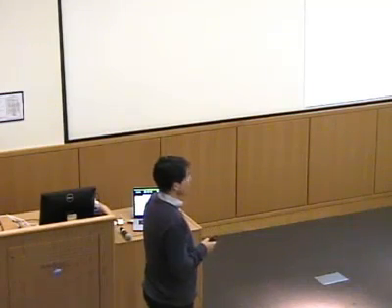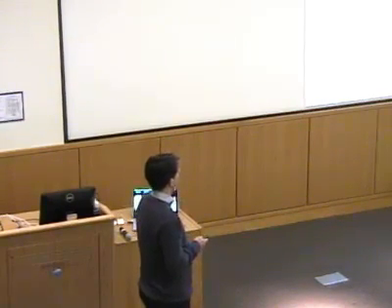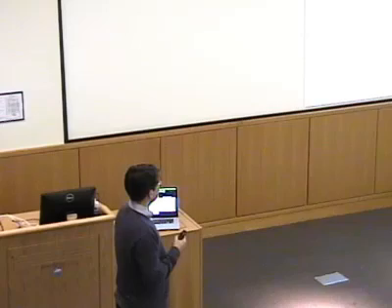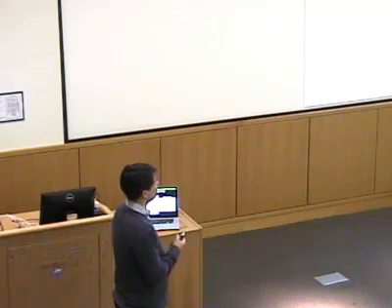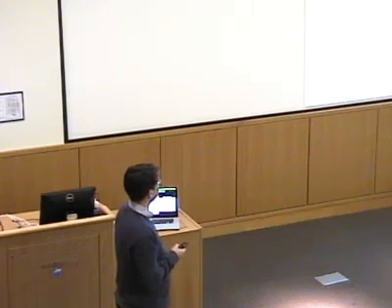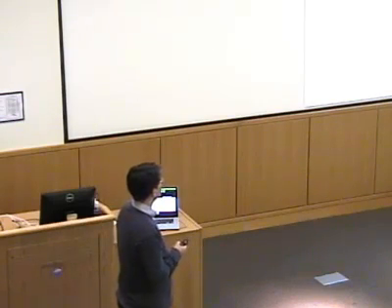So with that overview, we now slowly build up the physical content of these spectra by taking a look at vibrational frequencies and normal modes. Yesterday, I told you a long story about solving the Schrödinger equation for molecules, the Born-Oppenheimer-Schrödinger equation, and I told you that for any given fixed geometry, if you solve the electronic Born-Oppenheimer-Schrödinger equation, what you get is a total energy. Now, if you repeat that point by point, you get what you call a potential energy surface. That is a very unfortunate word because, of course, the energy that you calculate as a solution of the electronic Born-Oppenheimer equation does contain the kinetic energy of the electron. So calling it a potential energy surface to some extent is misleading.